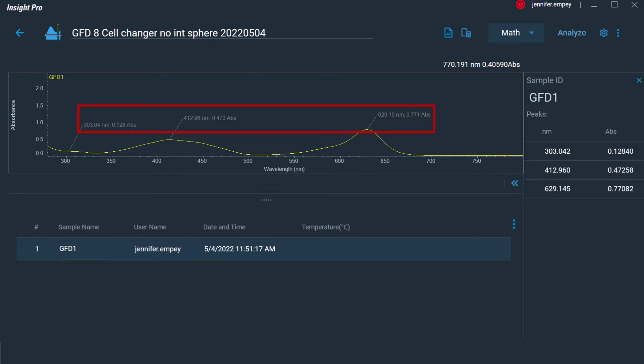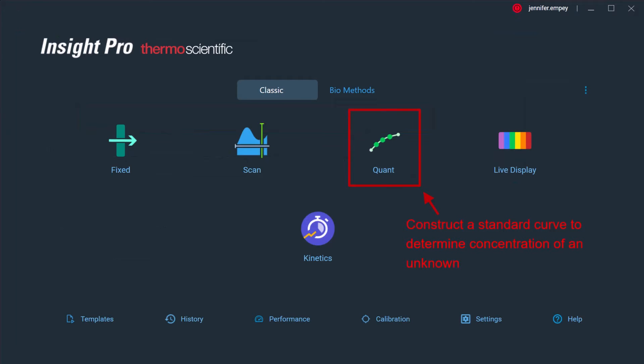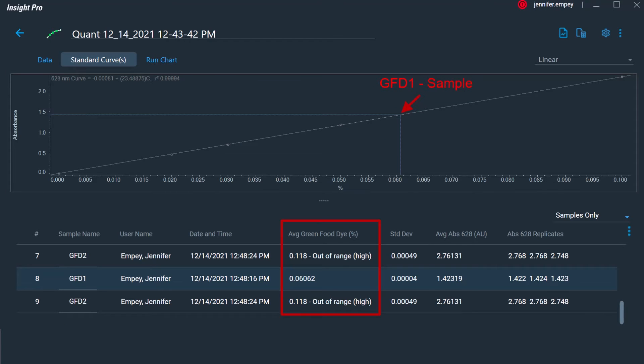The Quant application can be used to automatically generate a standard curve using solutions with known concentrations to determine the concentration of an unknown sample. The software will automatically calculate the concentration of the unknown analyte using the defined standard curve and will display an out-of-range warning if the unknown sample absorbance is outside the bounds of the established curve. Additionally, the concentration and absorbance of the unknown sample is clearly displayed on the standard curve.